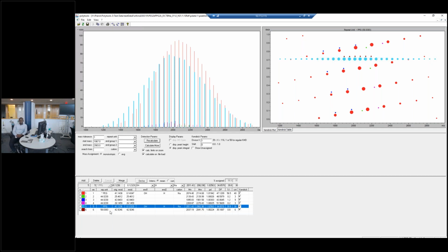That's quite broad, but for the TLC MALDI imaging, we have a dedicated software. It comes with the instrument, it's free, and it's very easy to use. All you have to do is just set the different points where you want to image, from what point to what point on a region on a TLC plate, and it will image it automatically and generate an image for you without having to do anything. I'm assuming that was for TLC imaging. That's what it sounds like. Yeah. Next question.